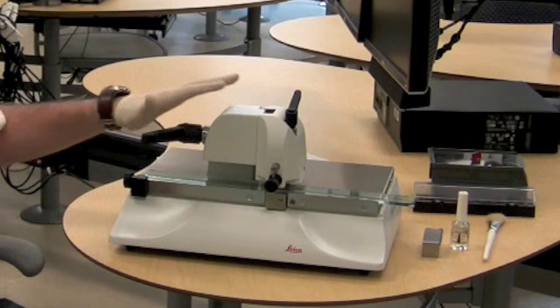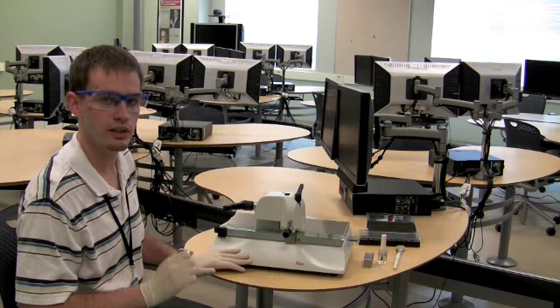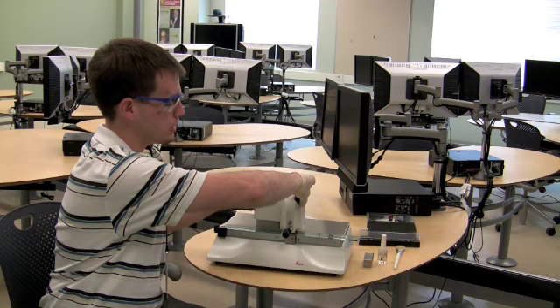What we do next is take our scoring shaft and quickly and evenly pull it out towards us. That's going to create a score in the glass that's going to be used to break it. Once we make our score with the scoring shaft, the next step is to break the glass. To do this, we take our breaking lever and slowly start to turn it towards us.